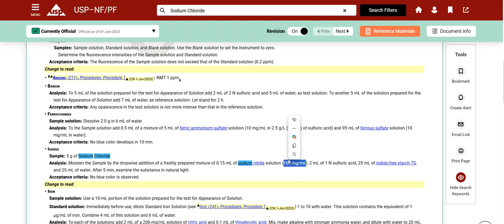So this is giving me a recipe right here, right? That's great. I can use that to go by. I just scale it up to however much I need. I probably need more than 1 milliliter. So if I need to prepare 50 mL, I just take 100 milligrams times 50, and that will tell me how many milligrams to weigh out for that 50 mL solution.